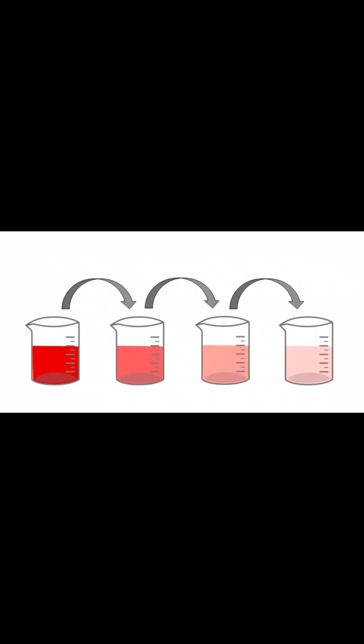A stock solution is a concentrated solution that contains a known high concentration of solute. It is typically used as a starting point for preparing less concentrated solutions by diluting it with a solvent.